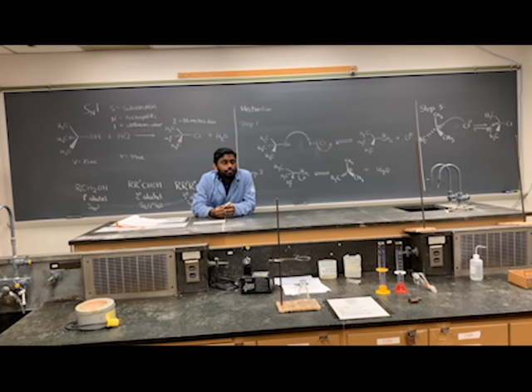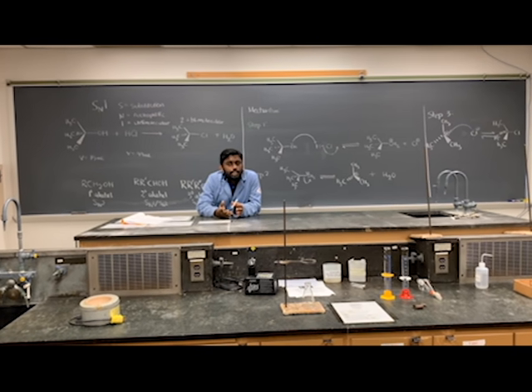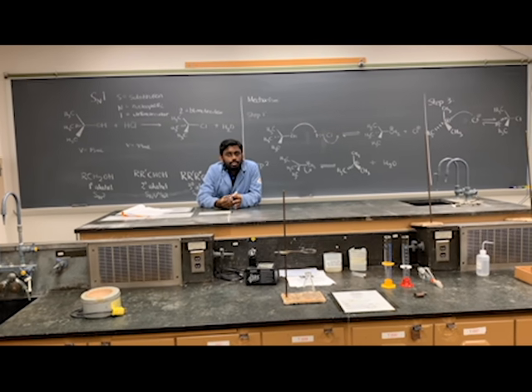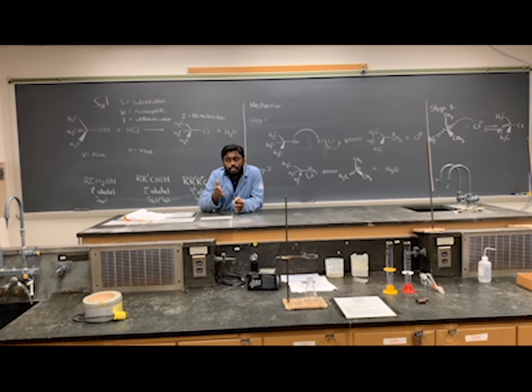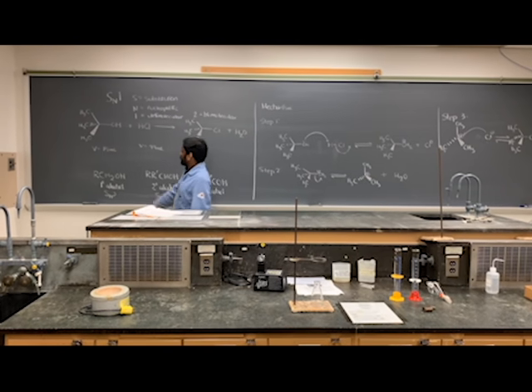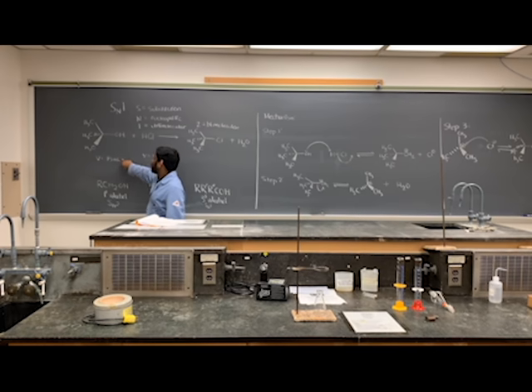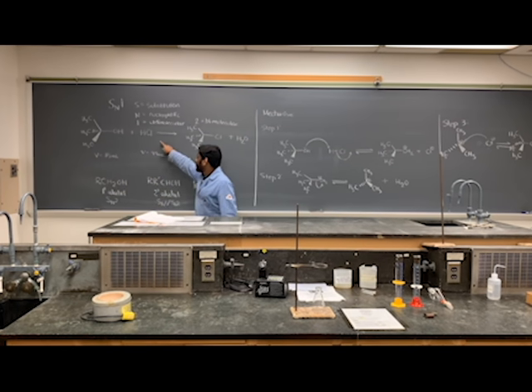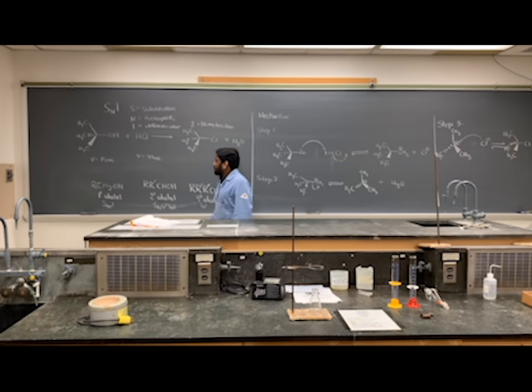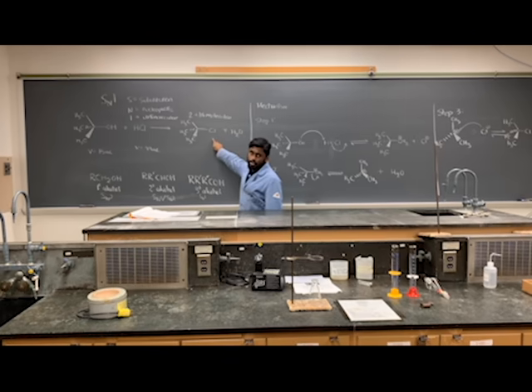So before we start the reaction, we actually need to put the T-butyl alcohol in a warm water bath so that it will become a liquid for us to handle it, because we are going to measure 15 milliliters of T-butyl alcohol, and we are going to need 44 ml of HCl, and we will be converting this to the corresponding alkyl chloride.